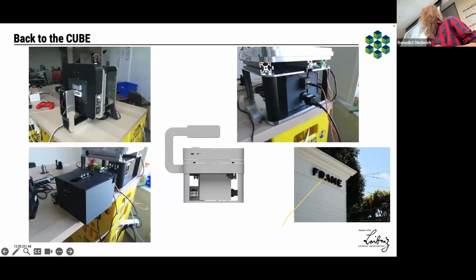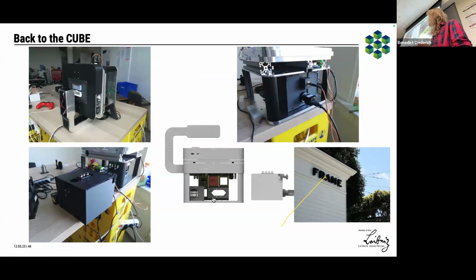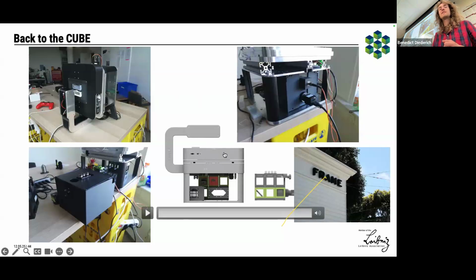We call it the frame, which stands for Fast Rigid Automated Microscope Engine, just a funky name. The core idea is that you learn with the segments, and once you're done building, for example, a confocal microscope or maybe an optical tweezer, it can be one layer here, and then you sneak it in, and it's just adapting to the rest. So the frame is literally a frame, just holding the optics, and the part on top of it is the stage, and here are some cubes for illumination.